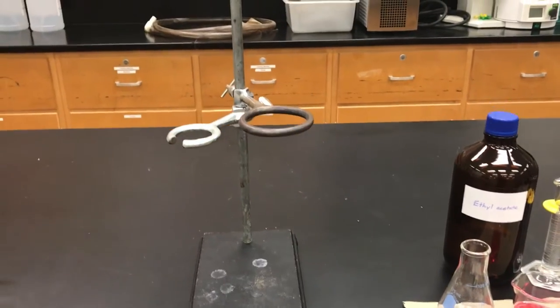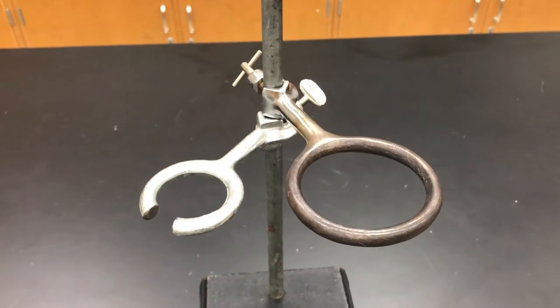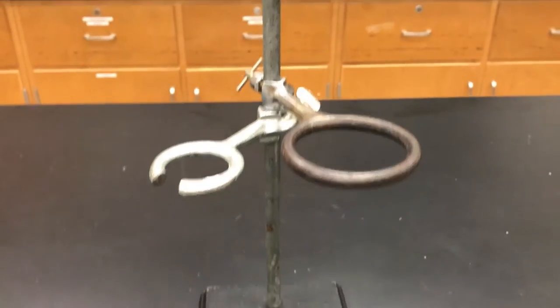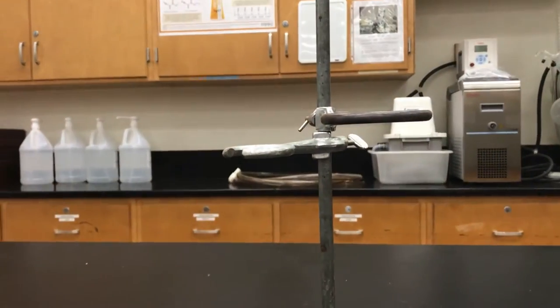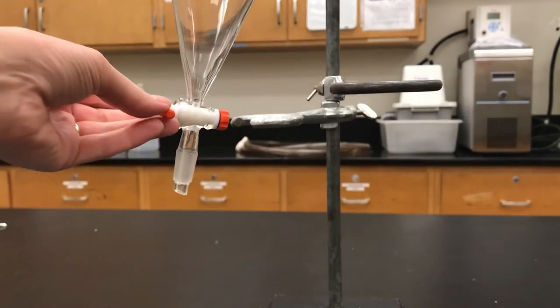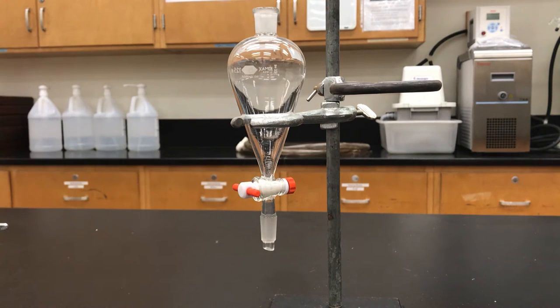Now let's get our ring stands ready. You want to assemble a ring stand and put on a ring clamp. They can look very different — this one on the left has a split, and the other is completely intact. The one with a split is nice for separatory funnels because you can slide it through and it can hold on to it that way.